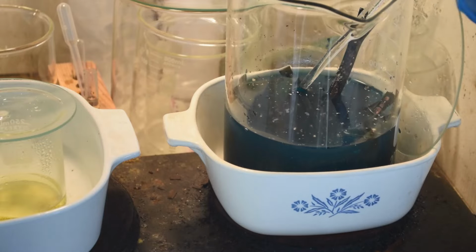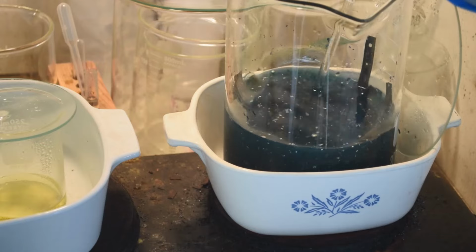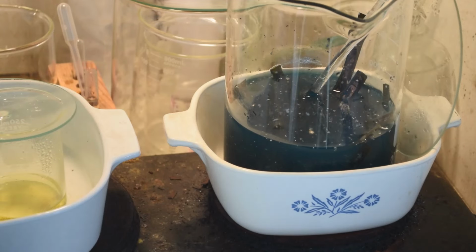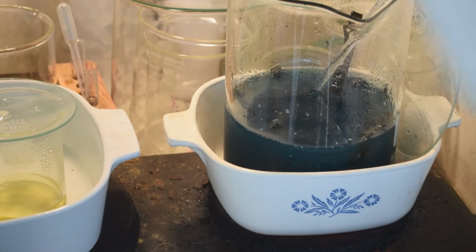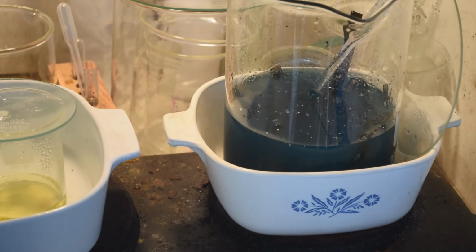The first step, though, is to pour off as much of this deeply blue-green liquid as I can without losing too much of the actual palladium. So I will set up for that. Let me see if I can get the stuff to sink with a spritz of water. It really doesn't want to sink. But I will pour this off through a filter so I don't lose the palladium. And then we'll work on separating the palladium flakes from the remaining bits of circuit board material.